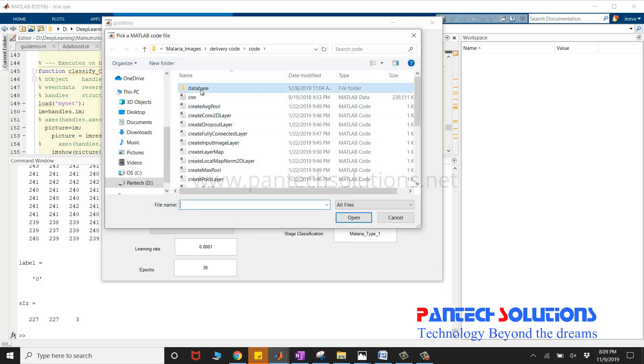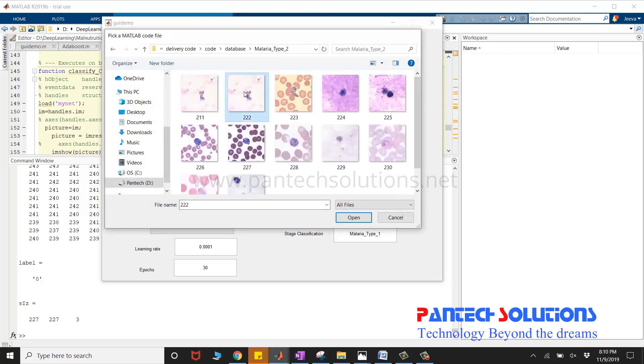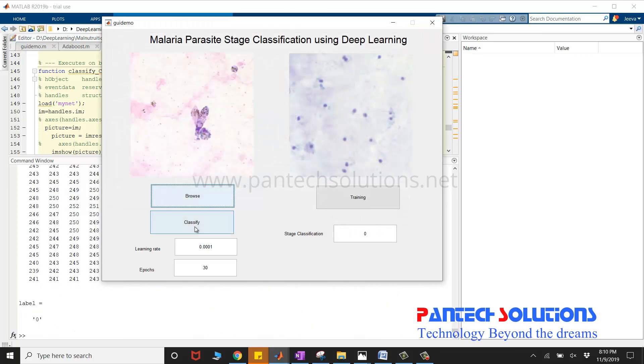I'm going to choose one more image to check whether it is classifying correctly or not.